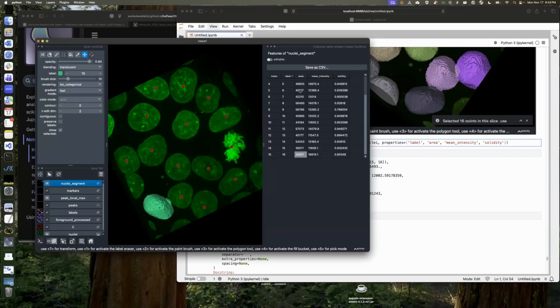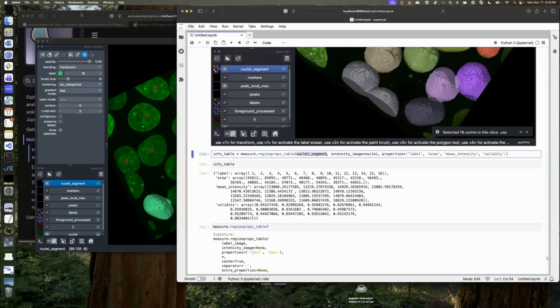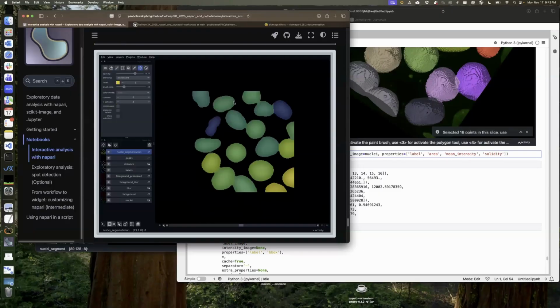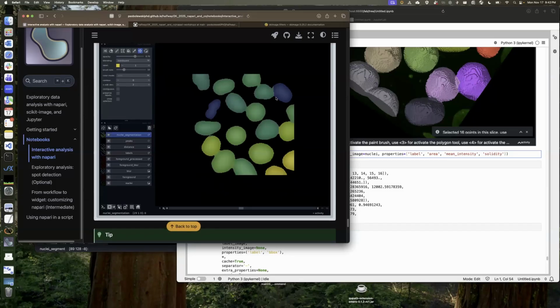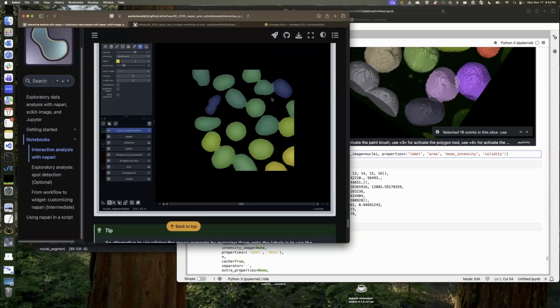But that's everything I had. But you can play around with these different ways to visualize your data and different ways to interact with it, using this approach of basically, here's in the materials. You can take a look at what I wrote here. So you can generate these different kinds of visualizations, which basically rely on computing something, and then, in this case, we're normalizing the data based on that. So you have some options here for these kinds of displays. So that's a quick way of generating something like a heat map.